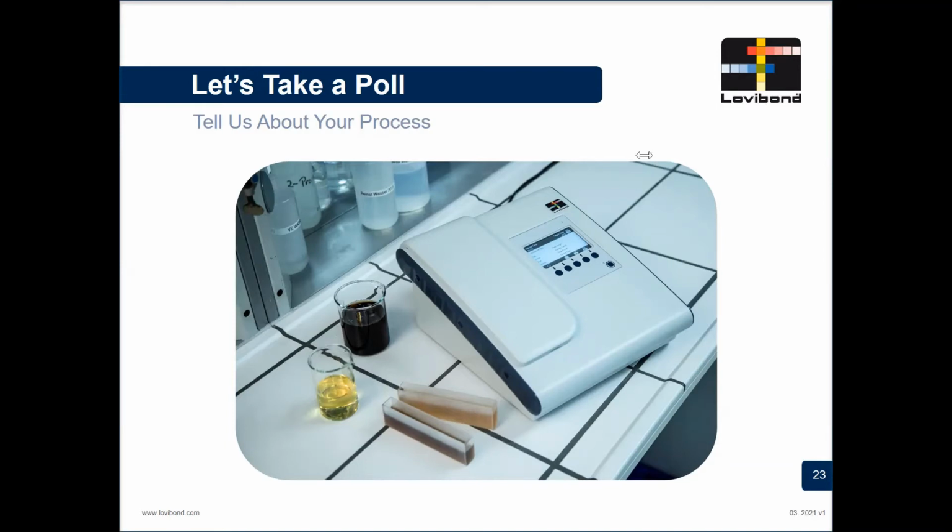So, are you heating your sample before analysis? 48% of you are. Are you filtering your samples before analysis? We've got quite a mixed result there, pretty equal between yes and no. And what path length sample cells do you use to analyze your sample? Most people are using 5 1/4 inch. So thank you for participating in the poll. I'm going to pass you back to Peter.